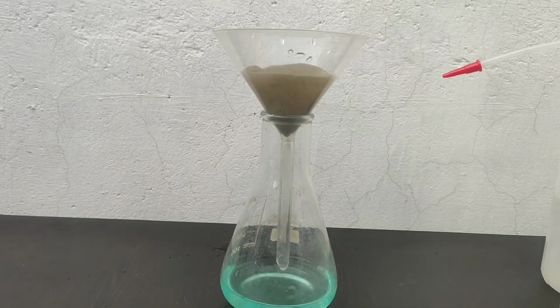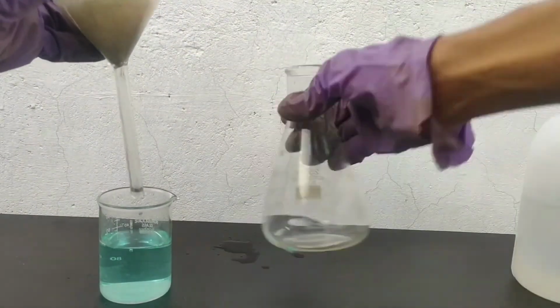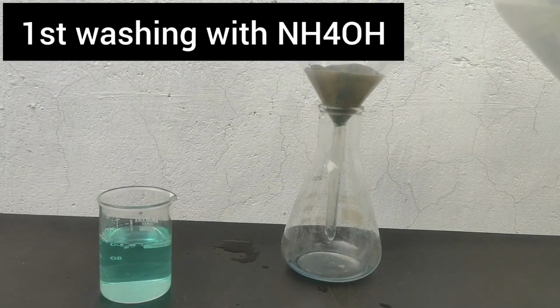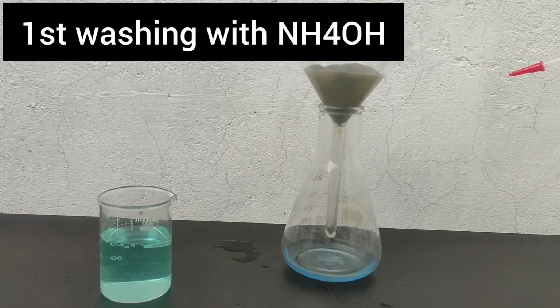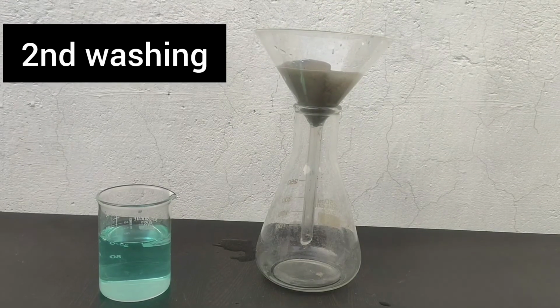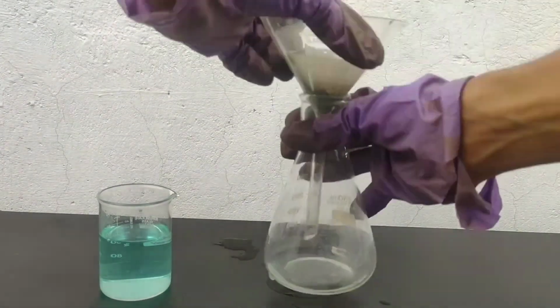After the solution stopped coming blue, I transferred all my solution into a beaker, washed the flask with some distilled water, and then I washed the filter paper and the precipitate of silver with ammonium hydroxide until no blue solution was formed. You can see the ammonium hydroxide washing turned dark blue, which indicates the presence of copper ions. So I again washed the precipitate and the filter paper with ammonium hydroxide and distilled water. These washings were repeated until no blue color was observed.